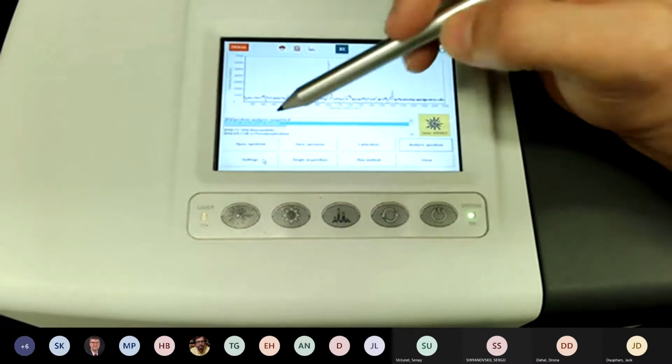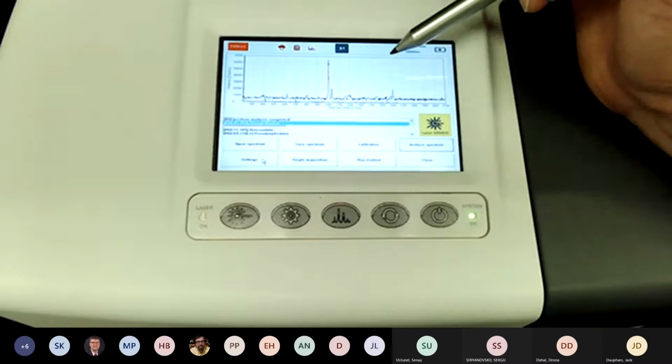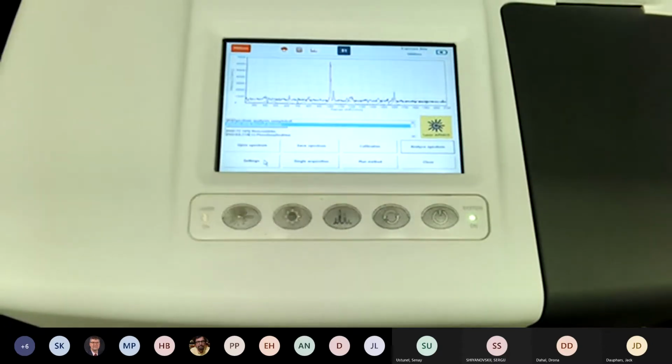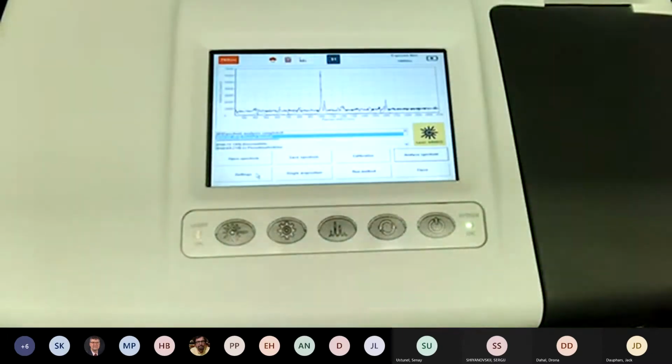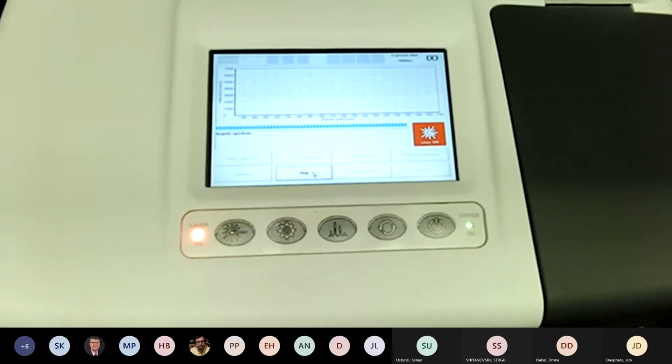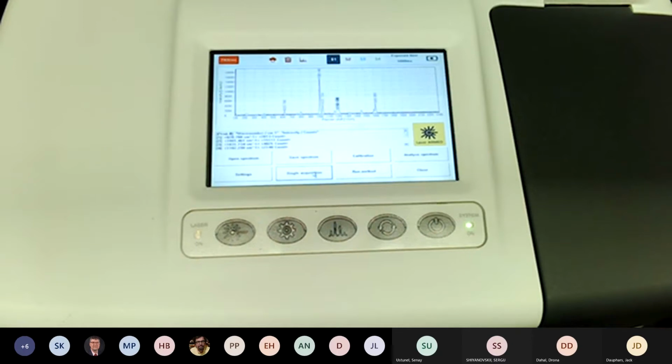All right, hold on, I'm sorry. Let's try and run again because that was not the best. Bear with me for a second, we're still working out some issues. I think I was a little off to the side last time. There, that looks better.